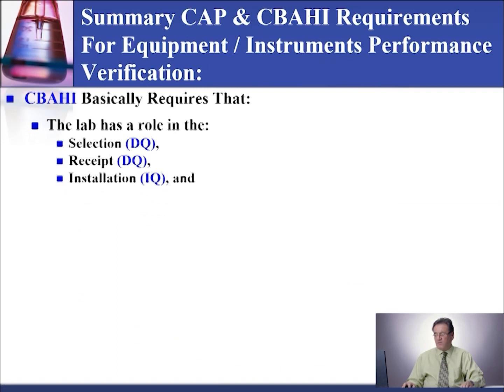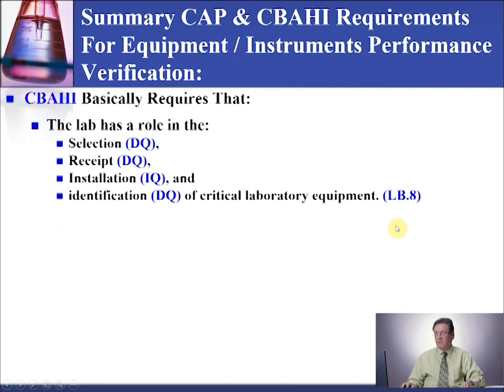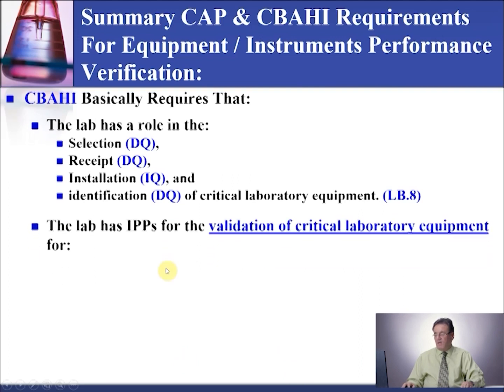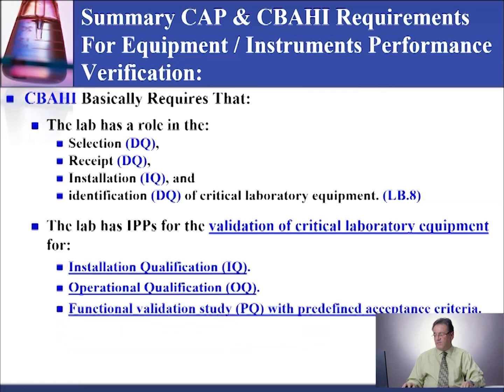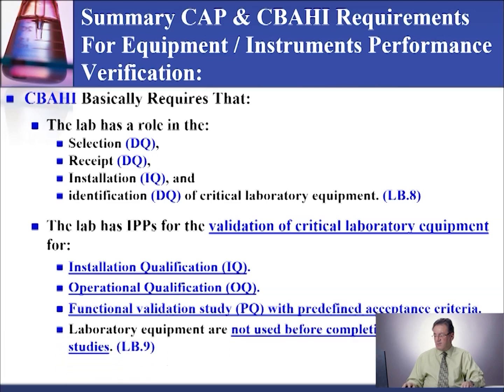Performance qualification can also be defined as the process of demonstrating that an instrument consistently performs according to specification appropriate for its routine use. This step involves a physical examination that tests the device. It is intended to confirm that the device actually works consistently within the specified limits that have been set by the manufacturer. This is the protocol that confirms that you can actually start using the equipment or the instrument.